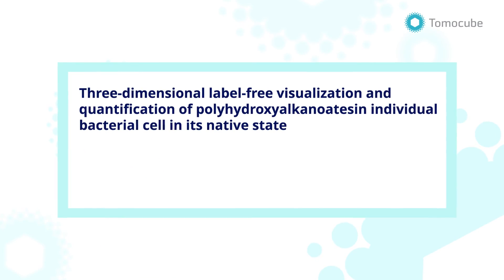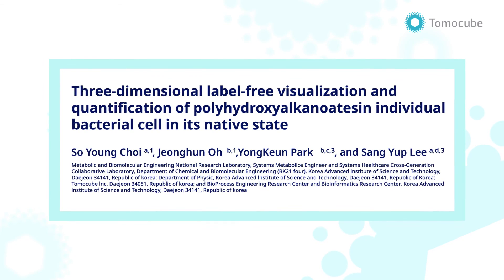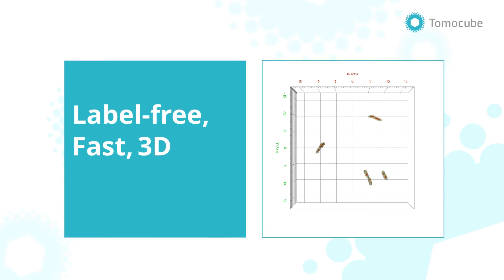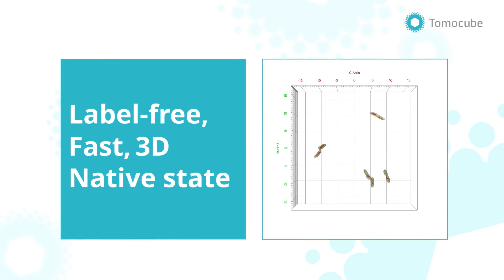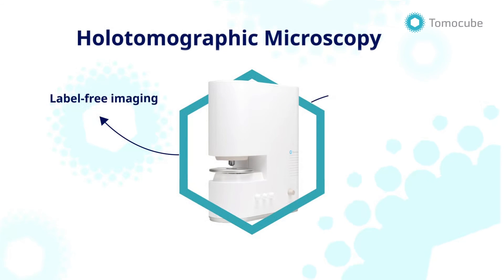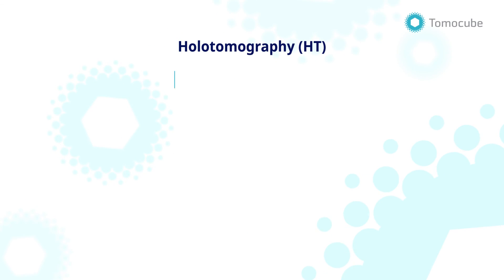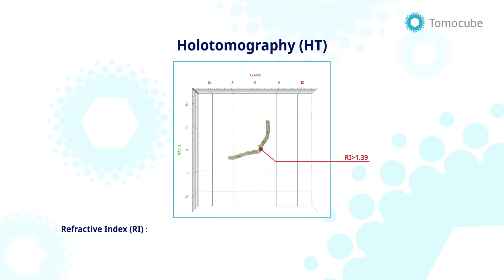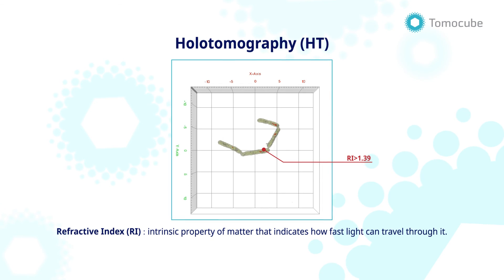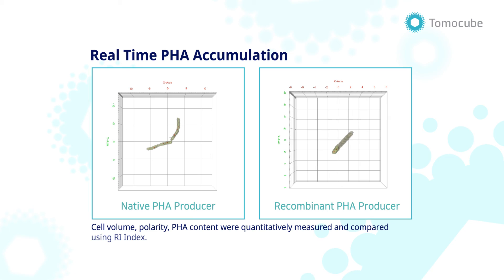An alternative mechanism of PHA synthesis has been uncovered using Tomocube's holotomography technology. Here, holotomography offers a label-free, fast, 3D imaging method that identifies PHA granules in the native cell state. It images cells and identifies PHAs using refractive index, an intrinsic property and indicator of how fast light can travel through it. In vivo, PHA granules were identified by the distinctively high refractive index region.